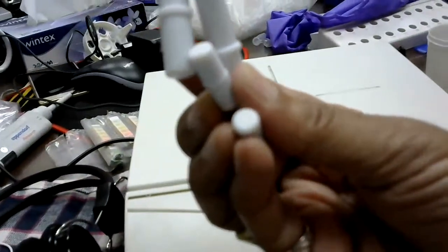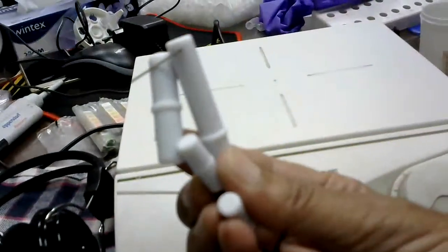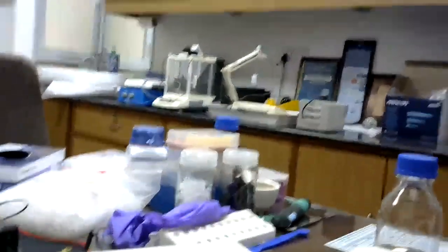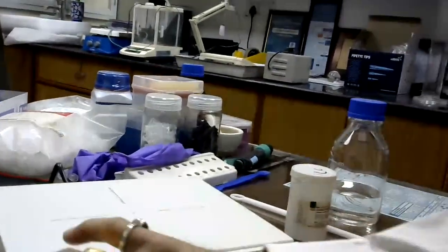And don't forget to wash this one, otherwise next time if we are putting this into another solution, it is going to contaminate your solution. So always you have to wash this policeman as well as this magnetic bead before reusing it, otherwise it is going to contaminate your chemicals. Okay.